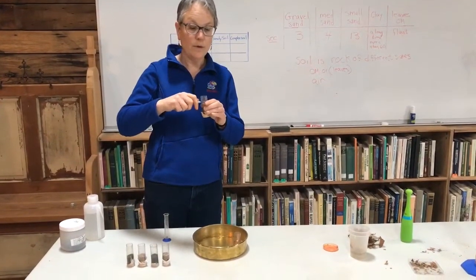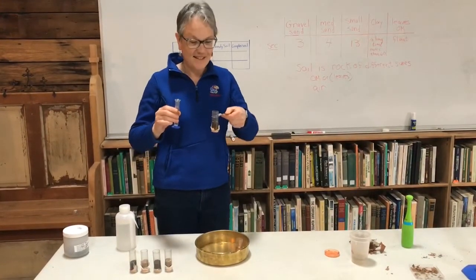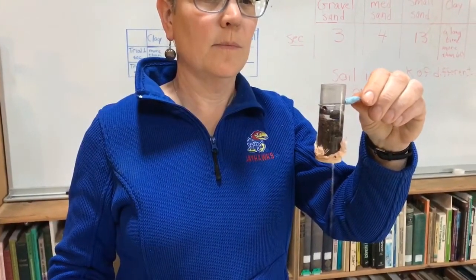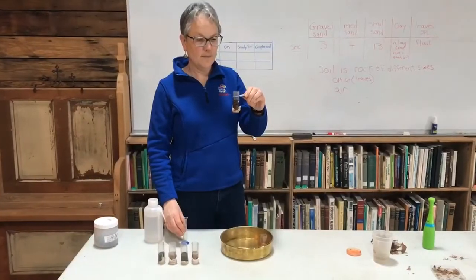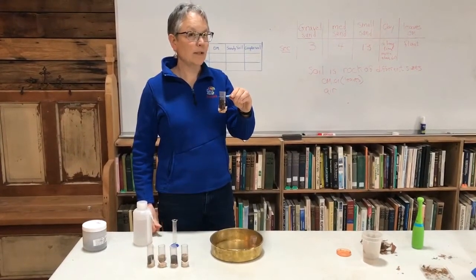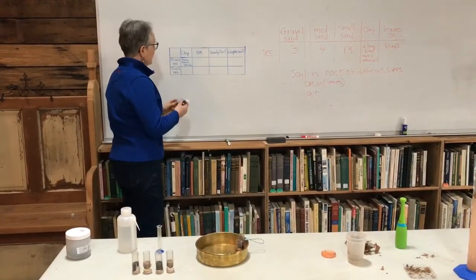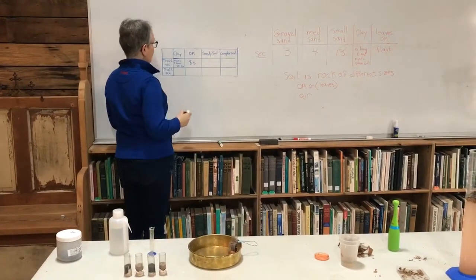Now we're going to do the organic matter. Are you ready? Okay, you're going to have to watch. So how many seconds did you count? I counted 8 seconds. So if you want to make a data sheet like this, you can. I'm just going to write 8 seconds.